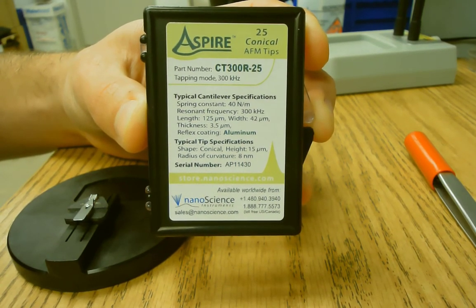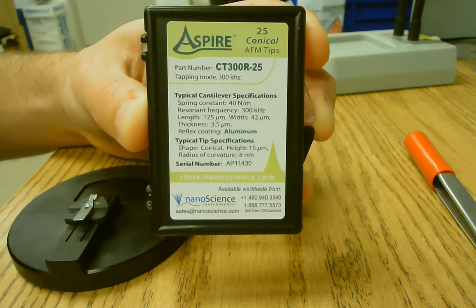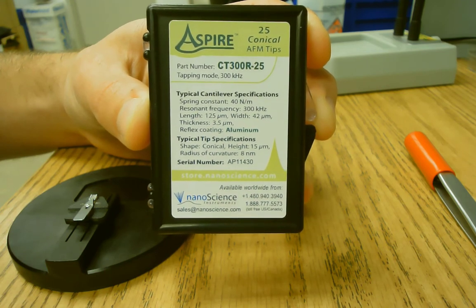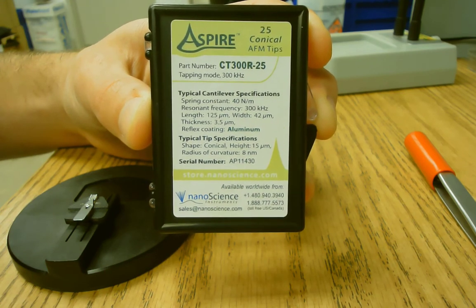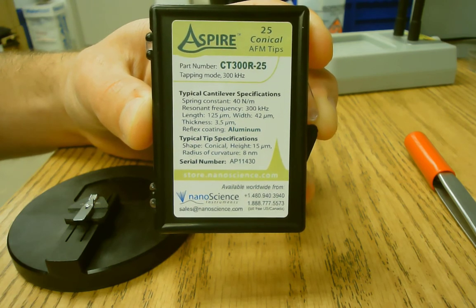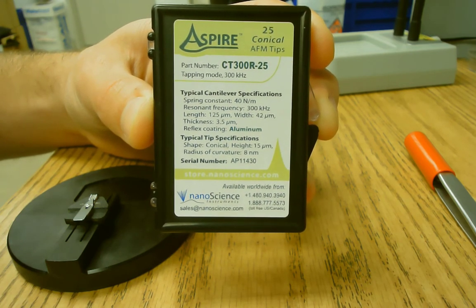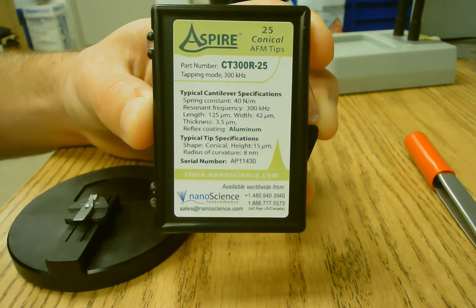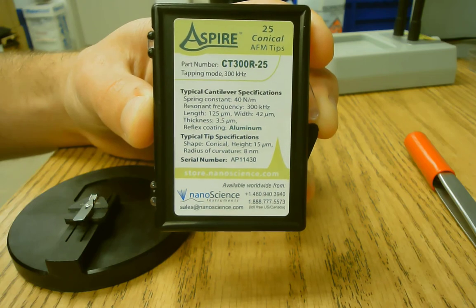So that is a coating that's on the back of the cantilever to allow the laser to have better reflection. And then it has the tip specification. So this is a conical tip. So there are pyramidal tips as well. There's several different types of tips. With a height of 15 microns and the radius at the very end nominally 8 nanometers.